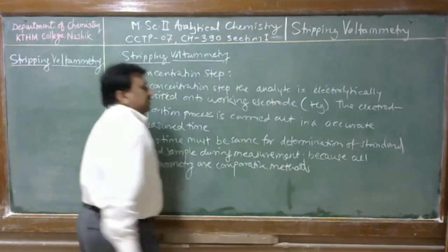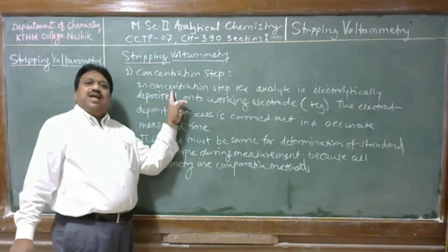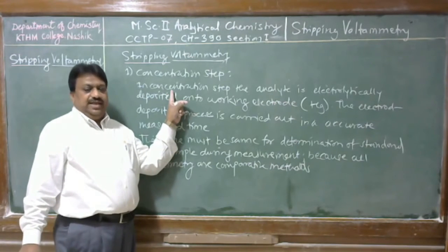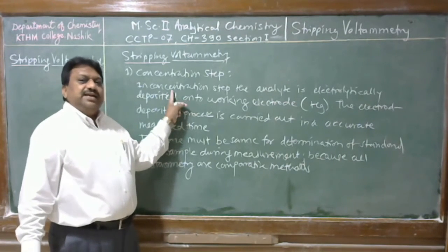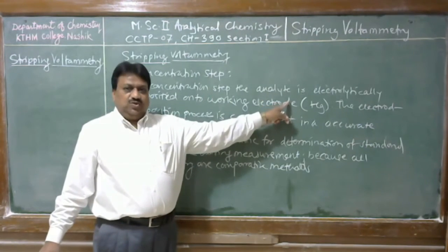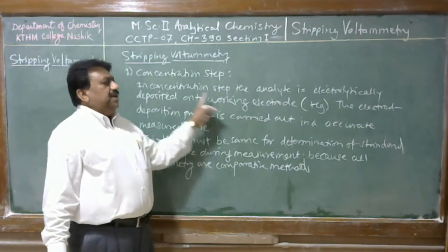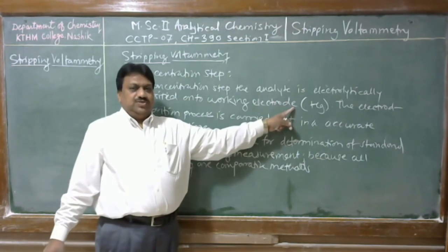In the concentration step, the analyte is electrolytically deposited onto the working electrode. During this, the analyte may be deposited by oxidation or by reduction process.